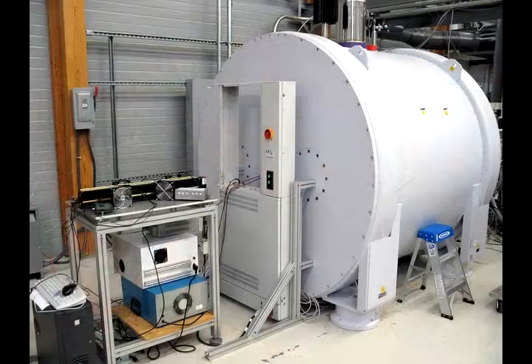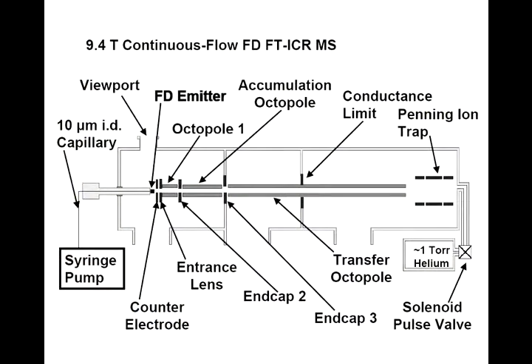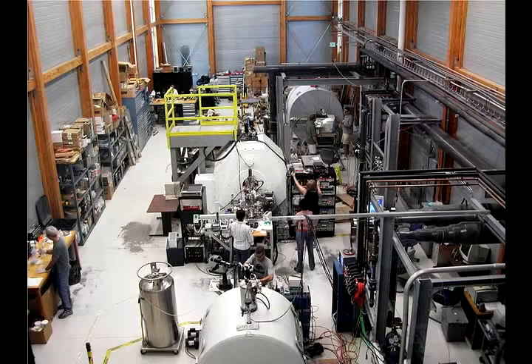What's all that stuff around the magnet? Yeah, one thing you'll notice is these magnets lie sideways. Pretty much all the other ones in the magnet lab are vertical. We like it the other way because then we can slide heavy apparatus in and out. These instruments aren't just the magnet. There are a lot of other things in there.